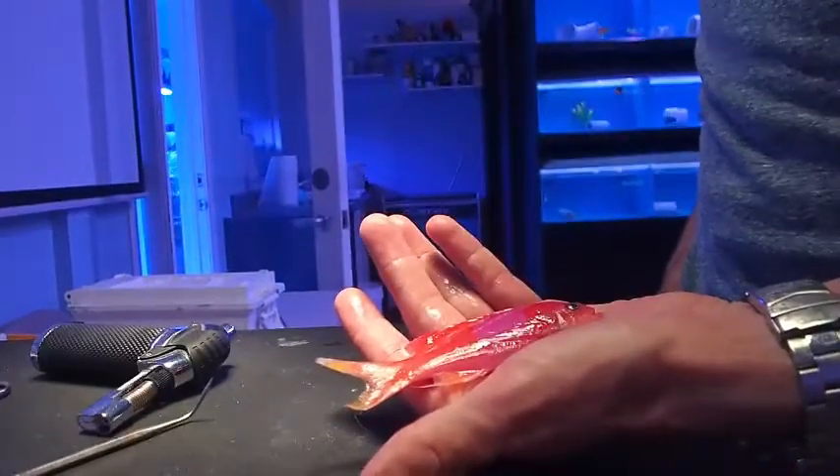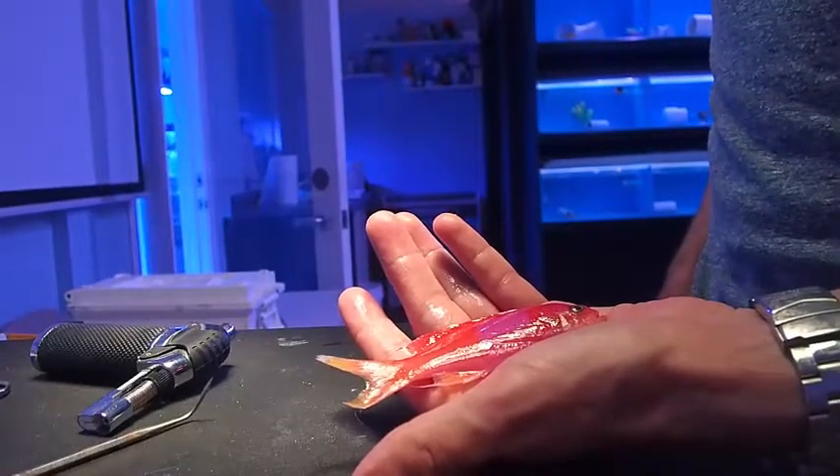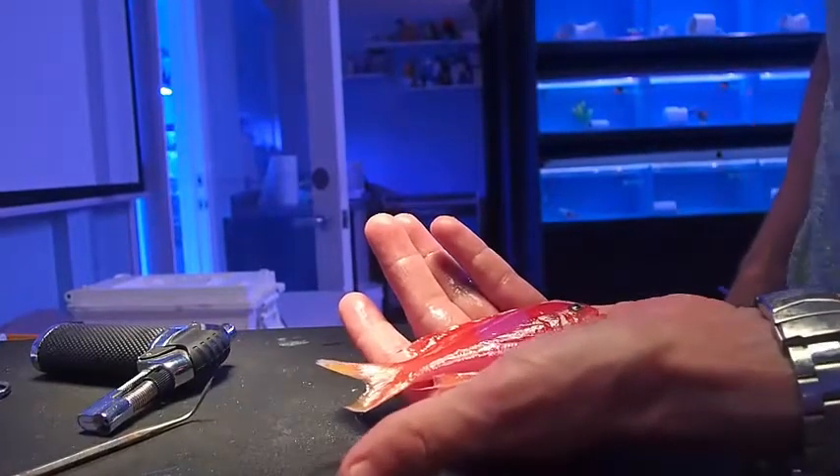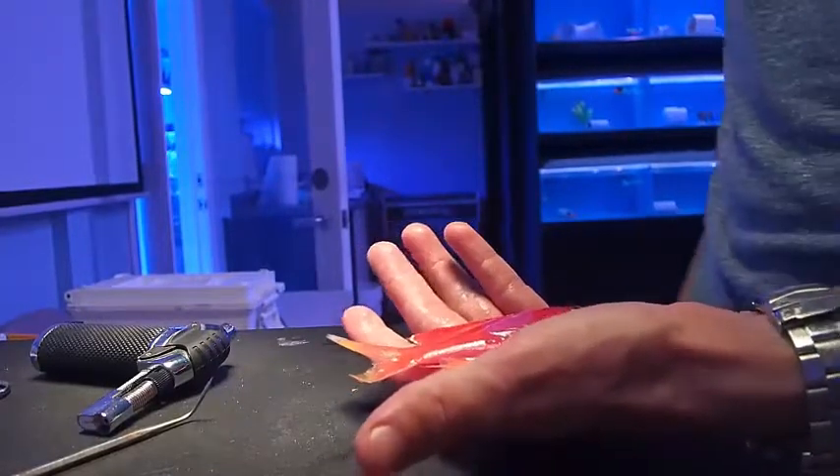We're going to do a skin scrape on a fish using a cover slip. This is a great way to identify external protozoans and, if you're set up for it, certain bacterial infections in fish.